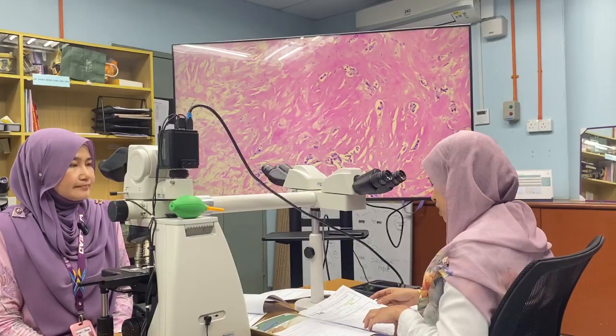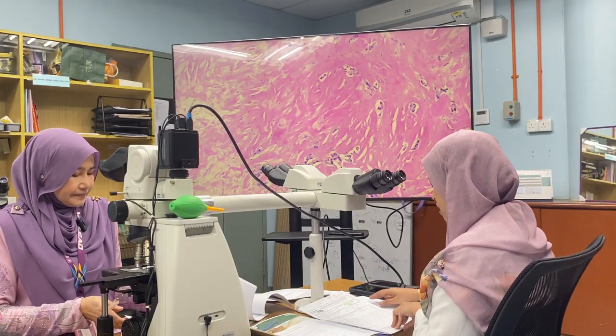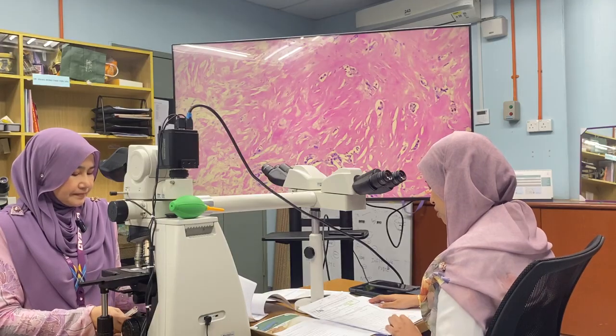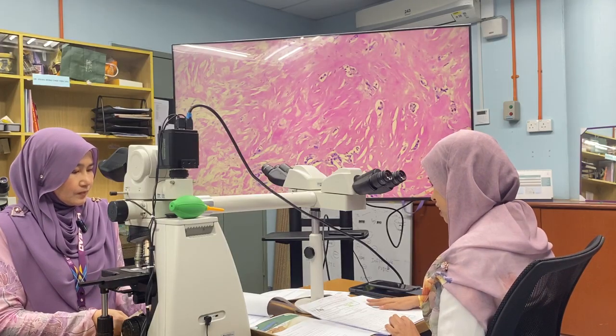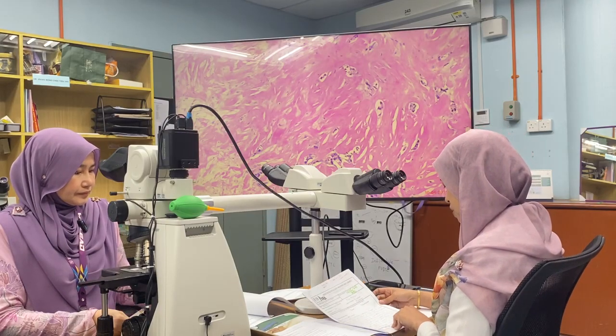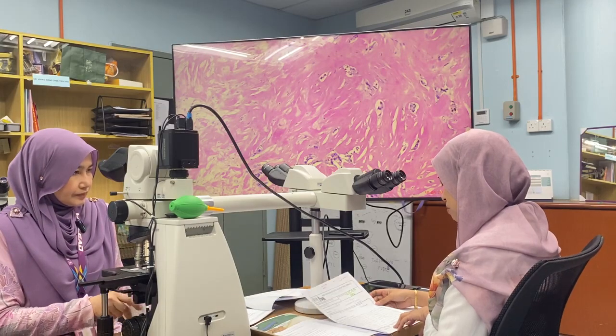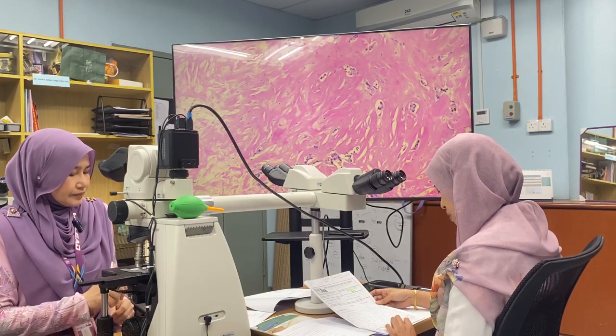So I received a left breast mastectomy specimen weighing 250 gram, tagged with one short suture as superior and one long suture as lateral, measuring 165 x 150 x 55, with presence of nipple-bearing skin on the superficial aspect measuring 105 x 90 x 5.